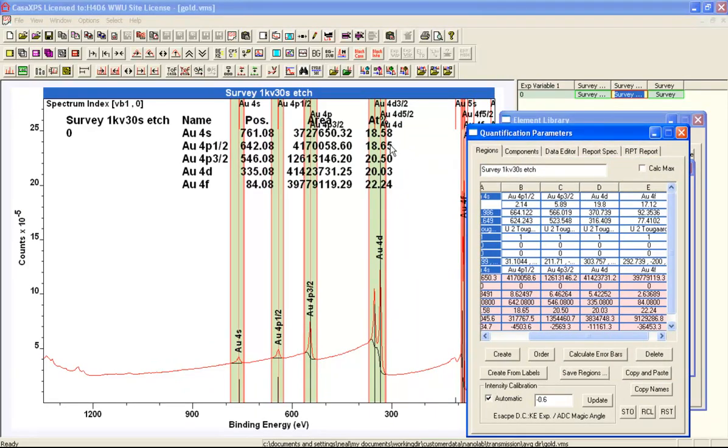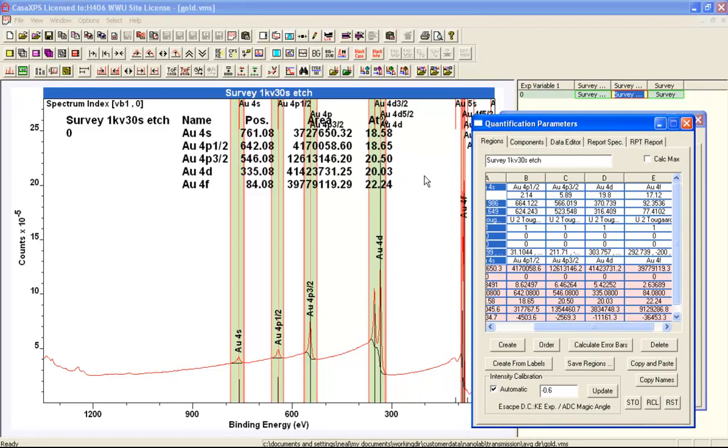We end up with a quantification. This is something like 18, 20, 22. So we have something that's close to what you'd expect, which it should be 20% for each one.